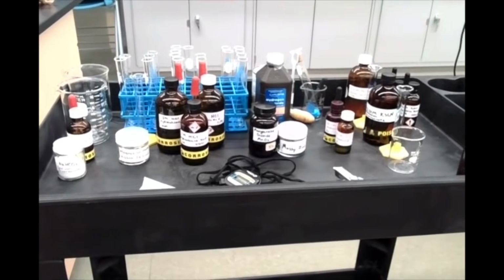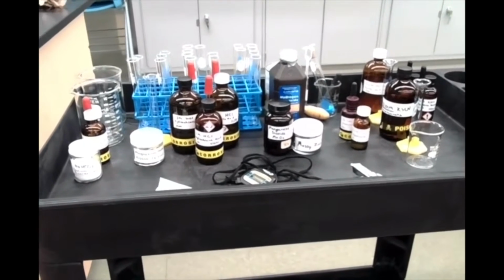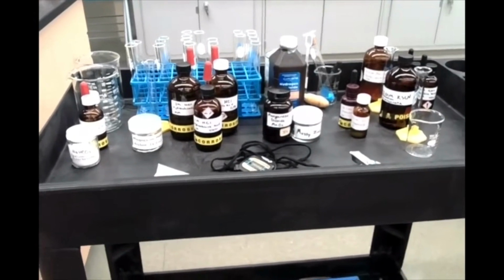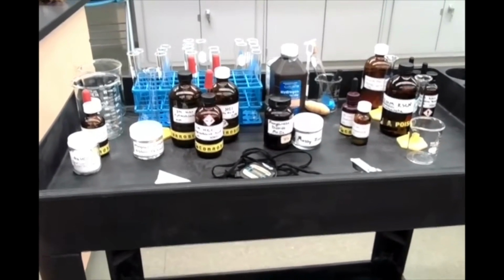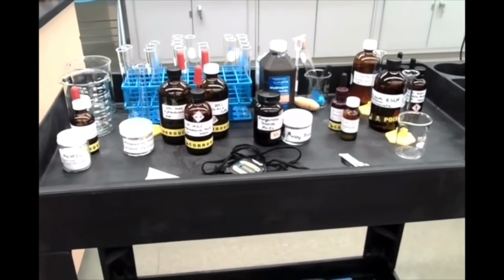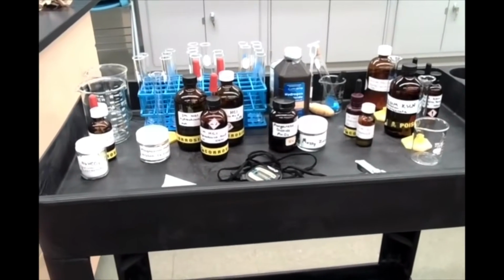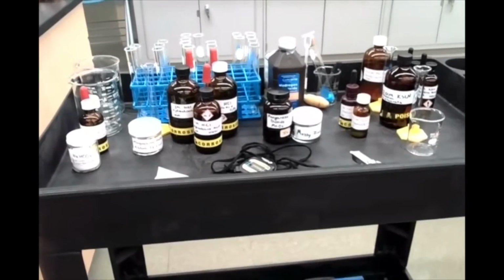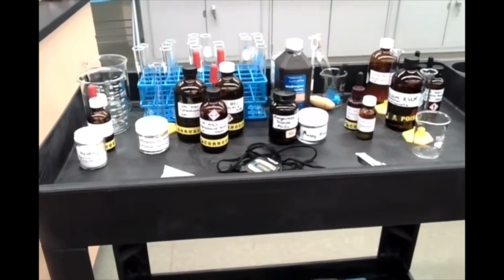In this week's lab, we are going to look at reactions and the factors that affect them. We're going to look at how things like temperature, concentration, and the presence of a catalyst can affect the rate of a reaction, can speed it up accordingly. And we're going to look at reversible reactions, where the forward and reverse reactions occur at the same time. We're going to see how this equilibrium that gets established can be shifted using Le Chatelier's principle. So we'll look at various factors that affect the position of this equilibrium.